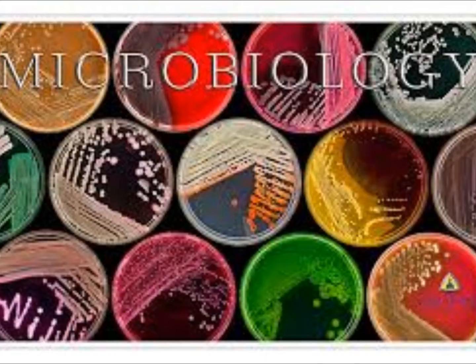Yes, number 7. Go to your Mac and your CNA plate, and for your 24 hours, record it as NA, because I didn't sub the Mac and the CNA, so you don't have it to look at today. So just put NA on glabrata for the CNA and the Mac. You will not be looking at those plates today, you'll look at them tomorrow.